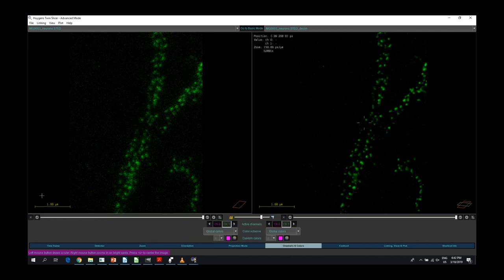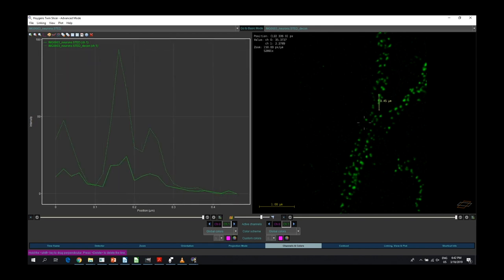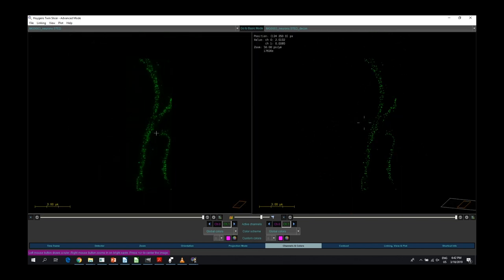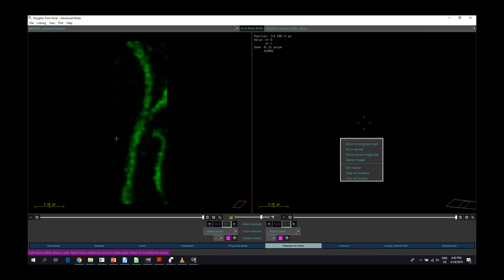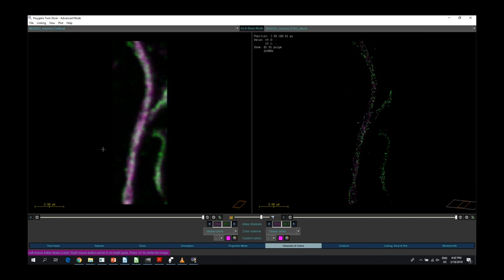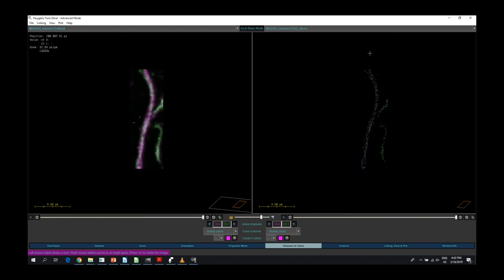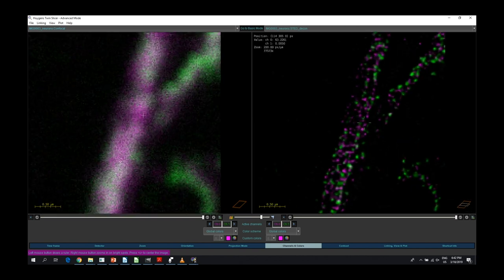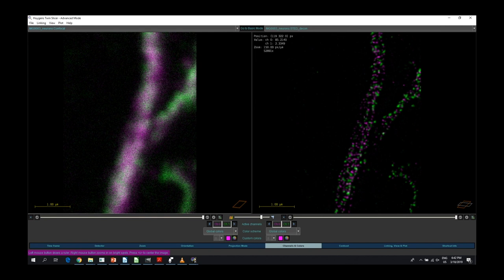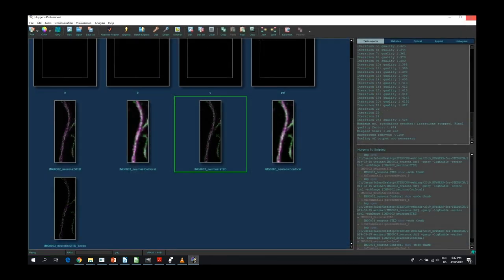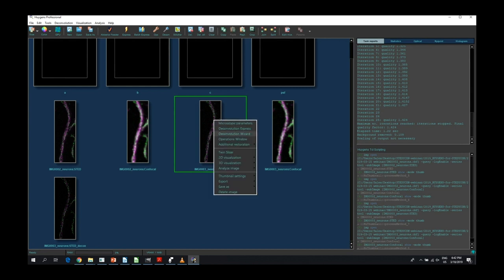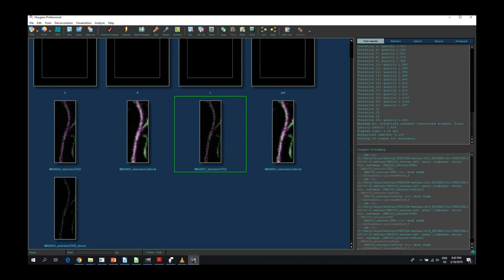We can inspect the results in the twin slicer, a very convenient tool to compare two images side by side. We have the raw dataset and the deconvolved dataset automatically opened. Looking at the green channel and drawing an intensity profile, you can immediately appreciate the contrast increase gained by the deconvolution. This will help significantly with image analysis since noise is no longer a hindrance. In the twin slicer you can also compare with the respective confocal image — in the confocal image everything is blurred out into one large structure, whereas with STED super resolution plus deconvolution you can nicely resolve all the small features. If you want more manual control, you can use the deconvolution wizard, which guides the user through the whole deconvolution process with full manual control on all settings.